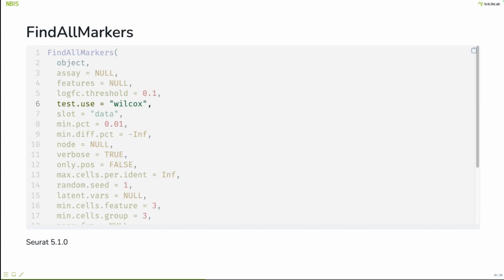If you have two samples that you're going to compare without clustering or anything before that, then no, you don't need to do integration. Then you can just go from the normalized data. Okay, thank you.